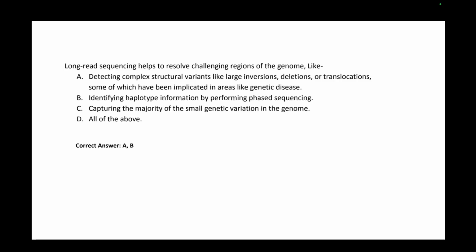In the middle, say at the 500th position, you have one variation, and the rest of the read matches the reference. Since this is also an error-prone process, there is a possibility of an error while aligning the reads. So in bigger reads, the small variants will be missed out. We'll consider them as an error and miss them.